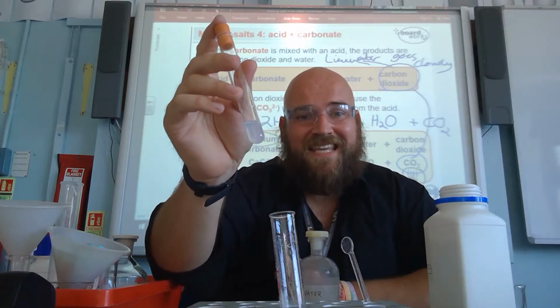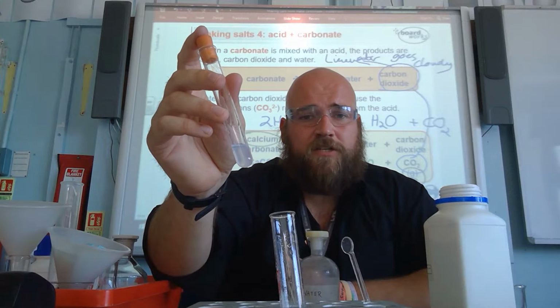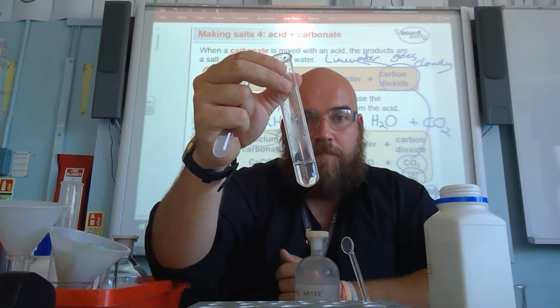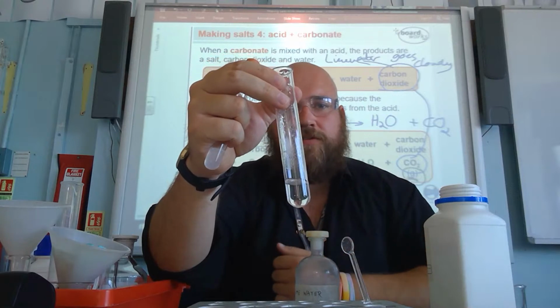So I've just pipetted the gas. I could have just got a delivery tube and bungs and just added more equipment to it. But again, I used the chemistry to my advantage. I know that carbon dioxide will diffuse from there, but I thought, I'll tell you what, it's going to hang around at the top of the liquid for a while. So I thought that's why I could pipette it.